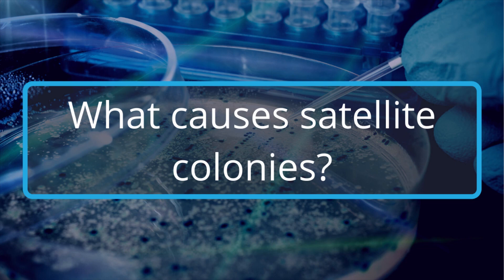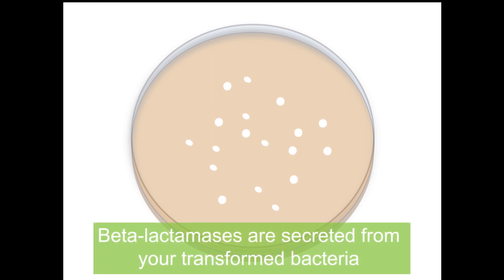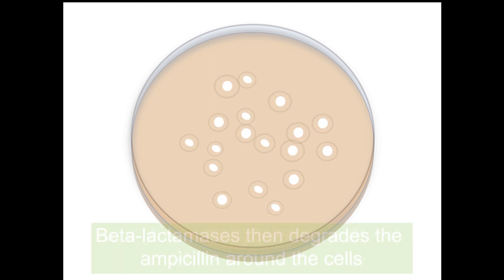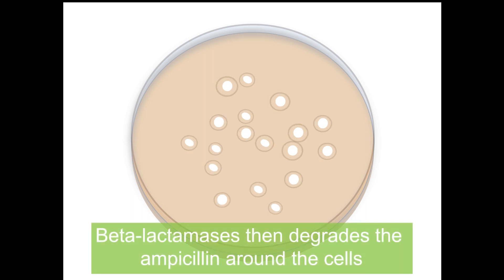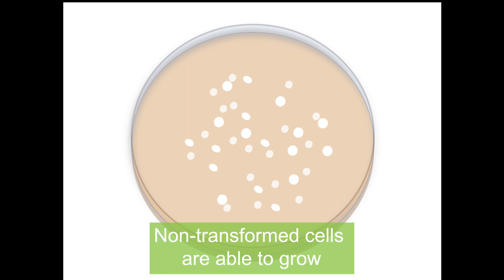Satellite colonies are the result of beta-lactamases which provide antibiotic resistance. The beta-lactamases are secreted from your transformed bacteria, and these secreted beta-lactamases from your transformed cells then degrade the ampicillin around them, so non-transformed cells can take advantage of this and grow.